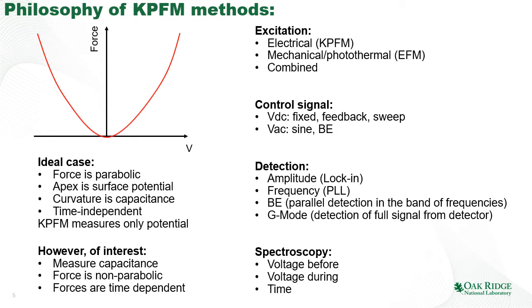Now, let's look a little bit at the philosophy of the KPFM methods. There is a large number of them, as I will illustrate in this lecture. The question is, how is the detection principle related to the physics that we want to explore?